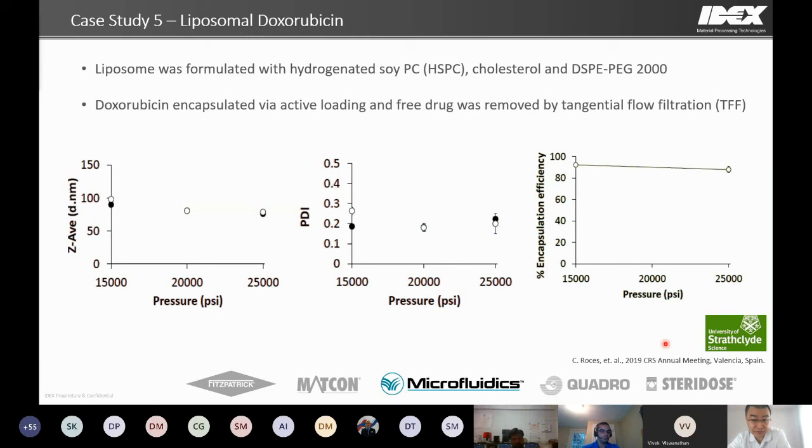This is not because of the method of the preparation technique. If you use any other technique, you will achieve this similar results. It's purely results from the physical limitation, because as you start to reduce the liposome size, the volume encapsulated inside will also be reduced, and so that's basically depends on how much drug you can dissolve in your aqueous phase.